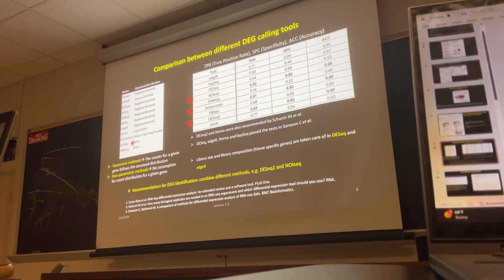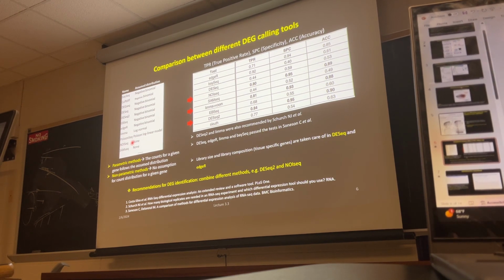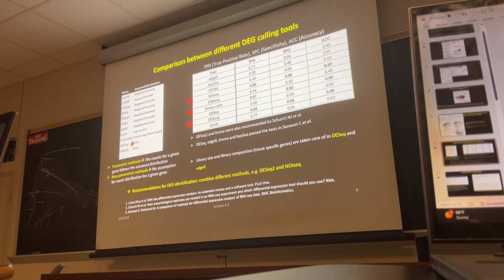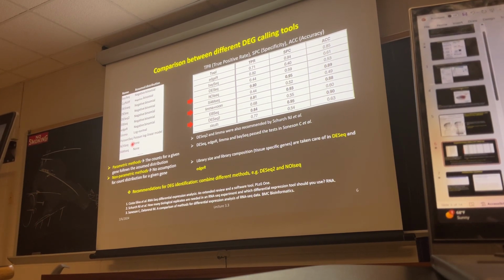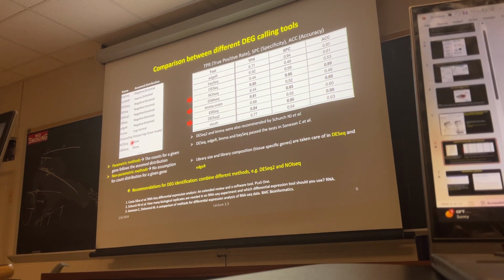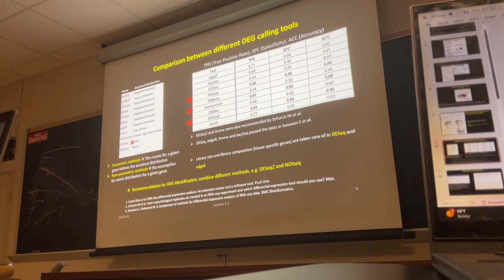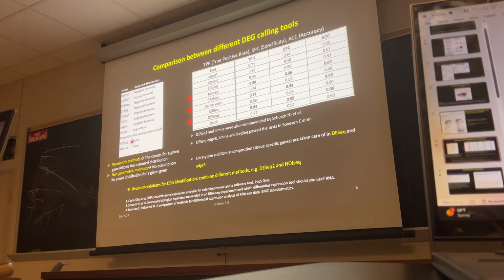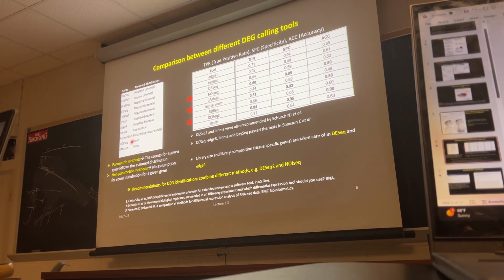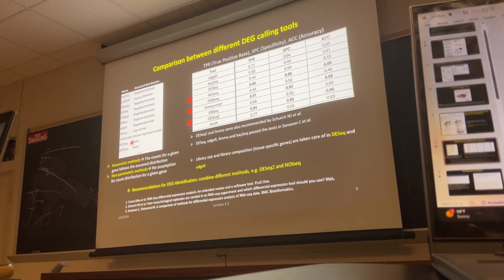If you understand it properly, then you will see why people are using DESeq2. There are a few videos, or you can just read the manual, where it is explained really nicely. But the key point is using two different tools and going for higher biological replicates over sequencing depth.